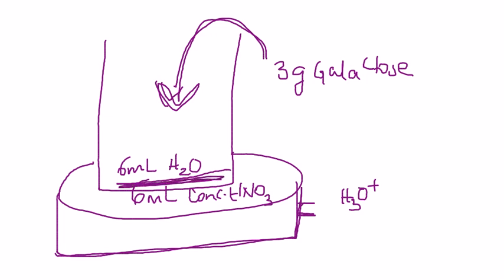So your solution will go from colorless to kind of like a faint yellow to the color of sugarcane juice, and it will intensify. If your color starts to look very, very brown, not a good sign. So then you'll have to start over. But usually a goldenish sugarcane type of a color is pretty normal. And when that happens, an exothermic reaction will take place.